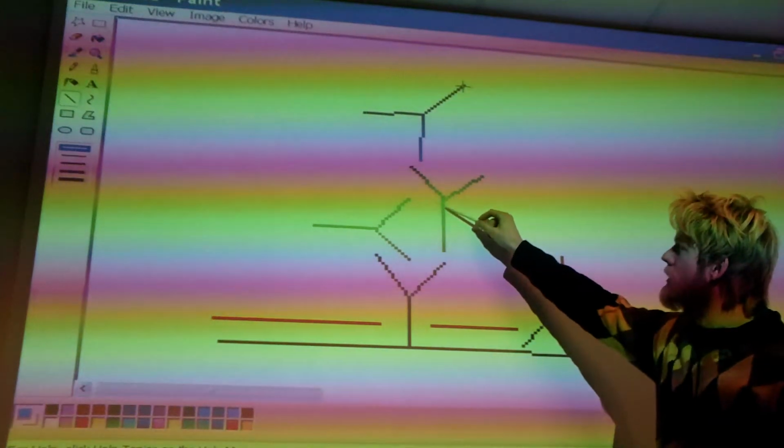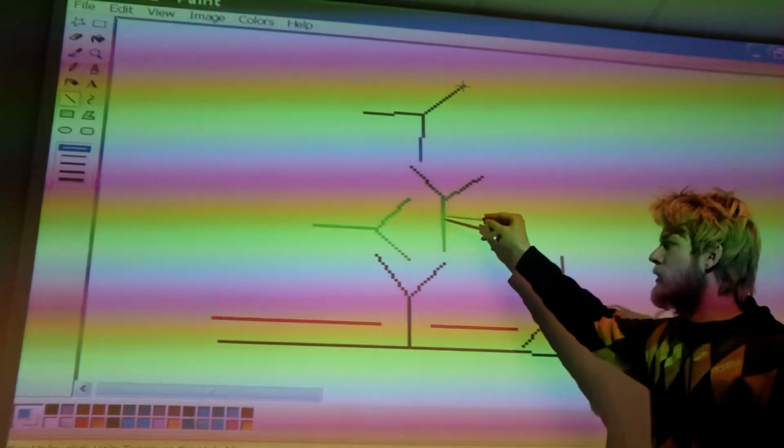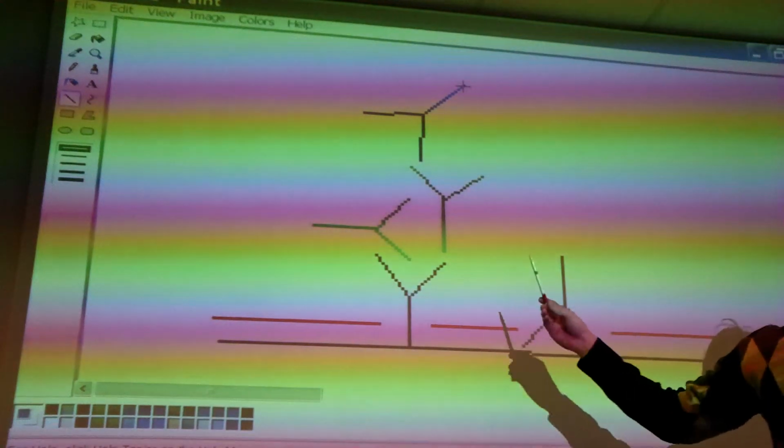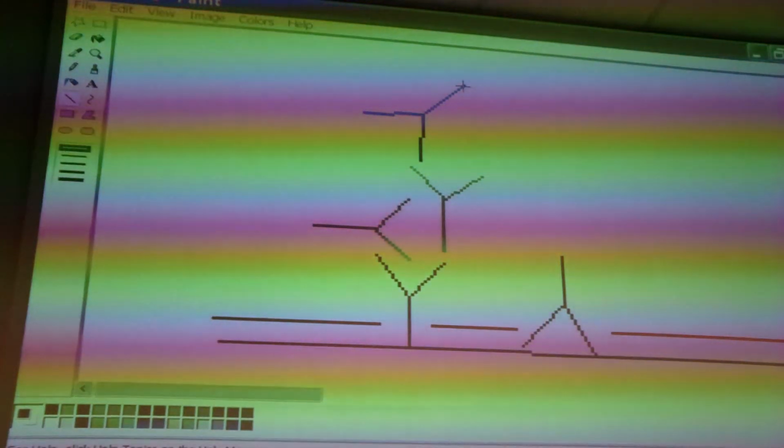We need that control, right? Because I don't think that there will be any, let's say, yellow antibodies binding here, or binding here. So there's a problem. I think that's completely true.